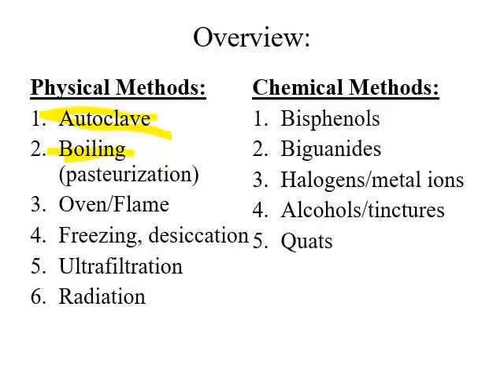That's why an autoclave is around 1.5 to 2 times the normal atmospheric pressure on the inside, and therefore that allows the steam from boiling water to be at a higher temperature, typically around 120 degrees instead of 100 degrees.